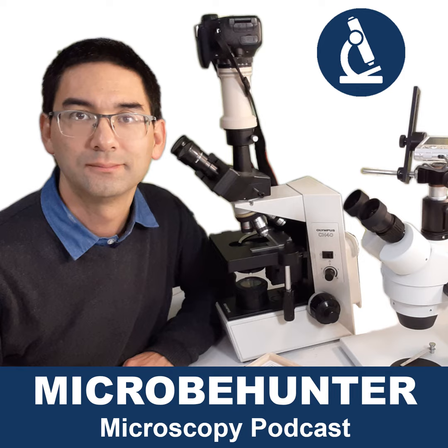Microscopes don't age. If you've got a reasonably good microscope and you take care of it, there is no reason why it should not work in 50 years. The thing is totally different with IT equipment, with computer equipment, and to that I also count digital LCD screens. They have a very, very short lifespan, and what would be a pity is if you were to make a good microscope with a built-in screen, because the electronics and all of that is going to outdate very, very quickly, while the microscope itself would retain its value for a very long time.